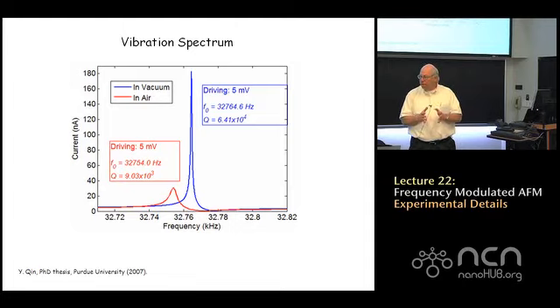It's single crystalline SiO2. The tines that oscillate are considerably thicker than the thickness of a silicon cantilever. So that means that the energy loss to the supporting structure of the tuning fork goes way down, and as a result, the Q goes way up.